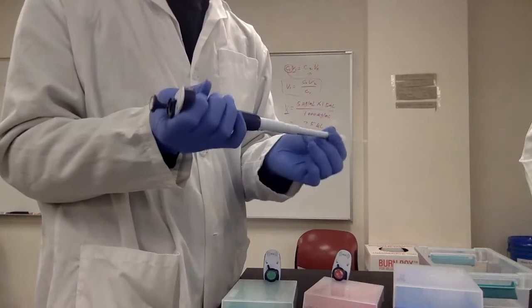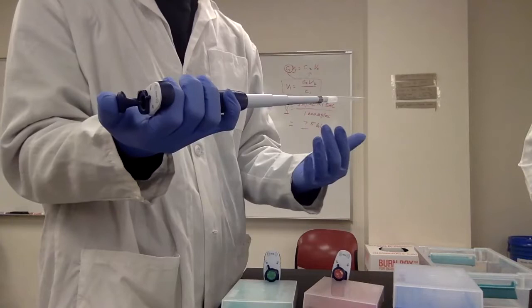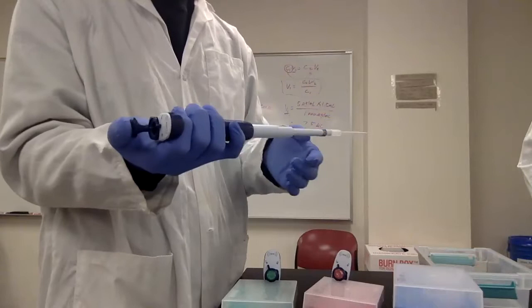Otherwise, if you connect this loosely, when you pipette, the pressure will not be specific. That will lead to a discrepancy when you're pipetting a specific amount of volume. So make sure you make it tight.